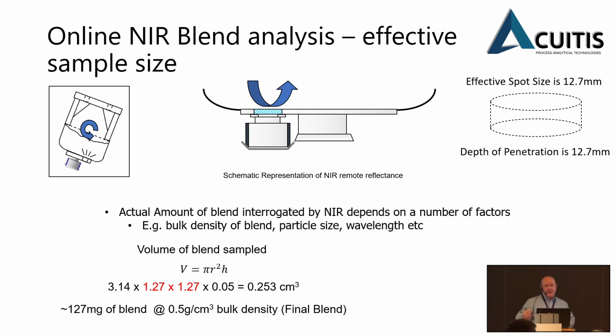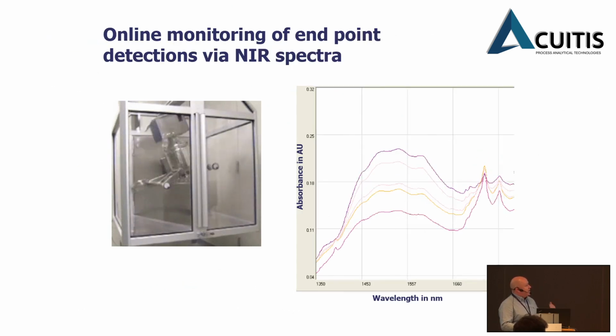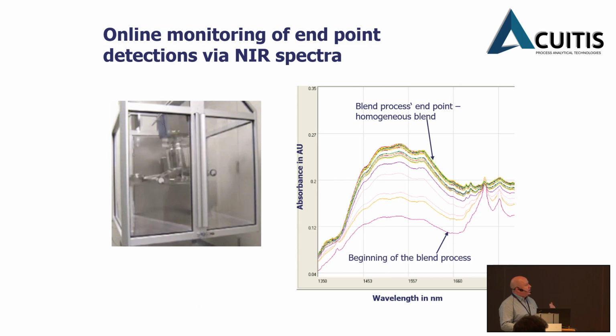So it's getting towards a dosage unit equivalence, which is the ideal really for PAT measurement in solid oral dosage forms. So in concept, what we have is a snapshot on every rotation as we move towards a blend endpoint, and that gives us a really good insight into what's going on inside the blender itself.